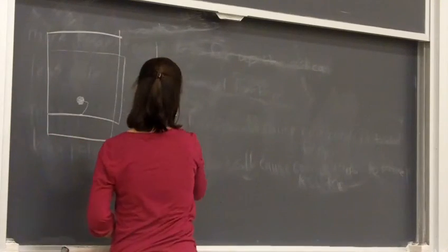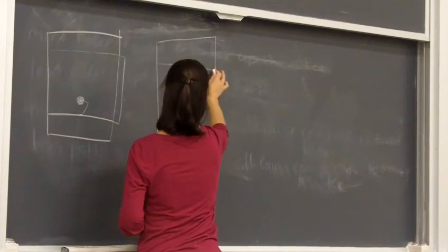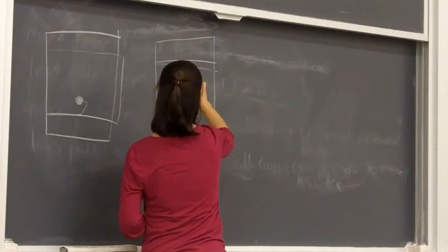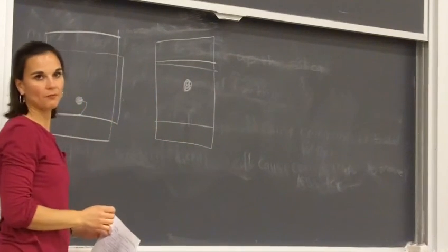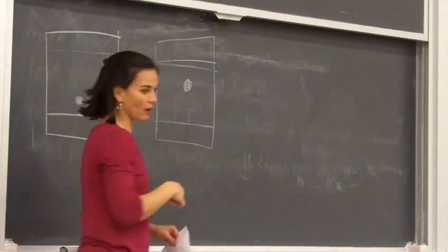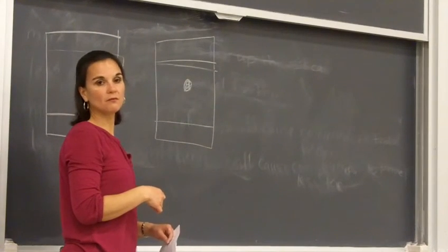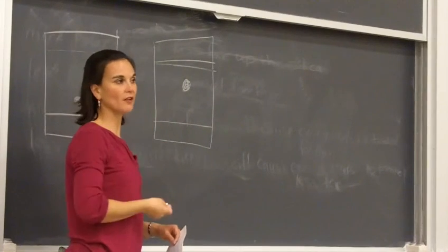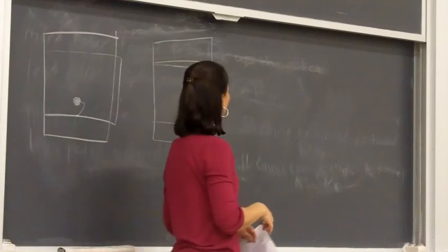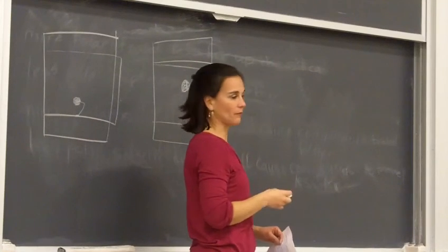Okay. So then hopefully we get something maybe like this. But then we've moved, that spot has a much bigger RF value, okay? Now what do you want to do if you want to lower the RF value? Then you, more hexane, right? You want to make the solvent less polar. So if you want to drop the RF value, less polar solvent, so in our case, more hexane or more of the relatively nonpolar solvent, okay?